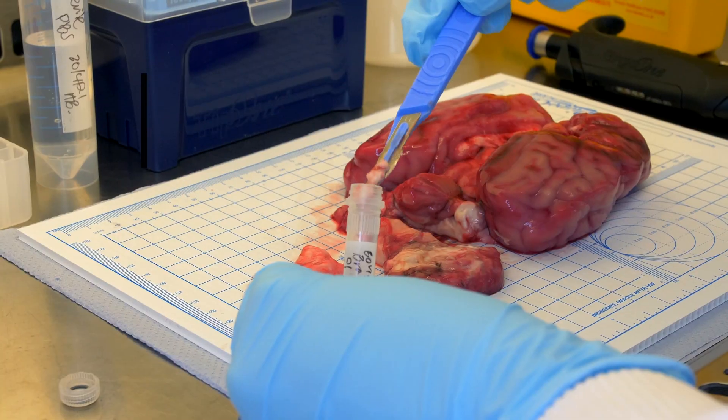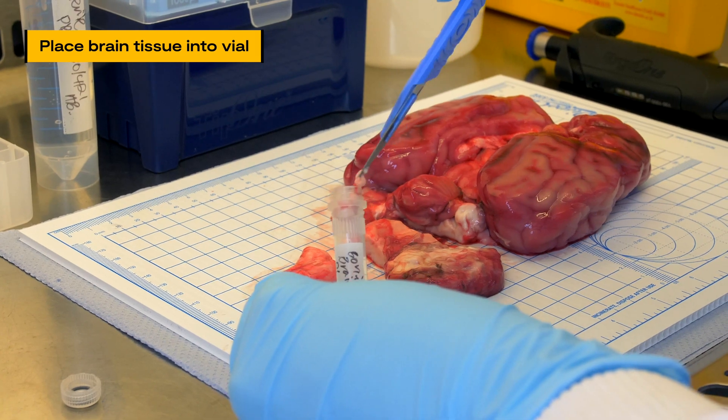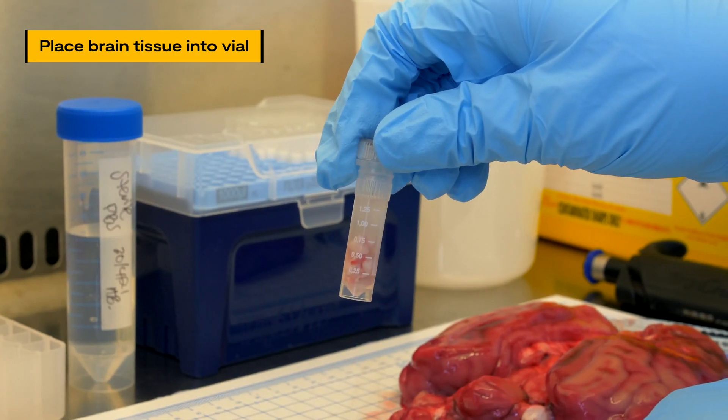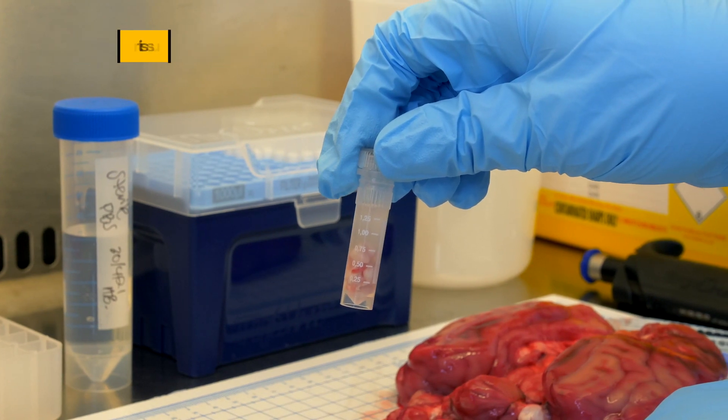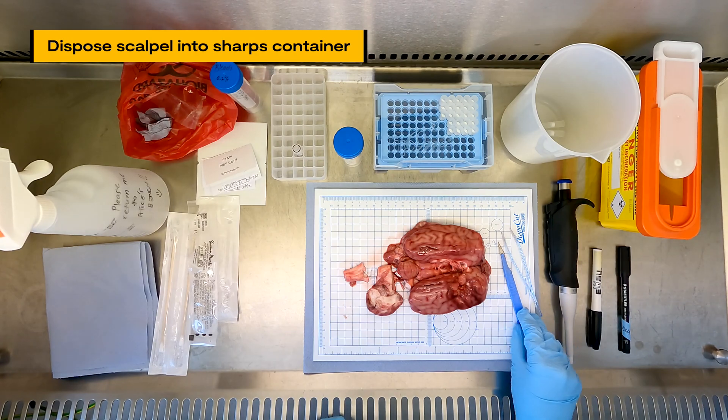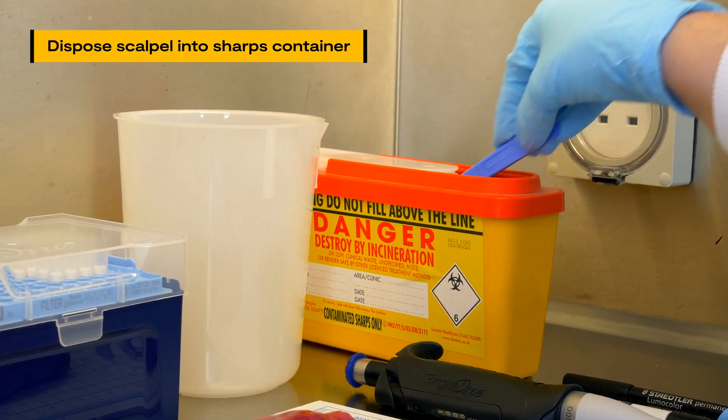Using the scalpel, place the brain tissue into the vial with PBS. The liquid level in the vial will rise to approximately 1.5 millilitres. Once there is enough brain tissue in the vial, dispose of the scalpel safely in a sharps container.